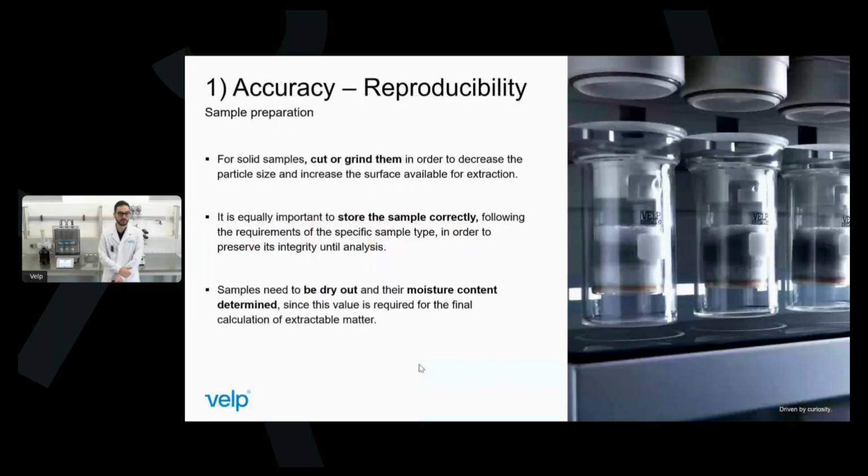Starting from some general things that we can face in both extractions, for solid samples the sample preparation is really important, because we have to cut and grind them before starting the extraction in order to decrease the particle size and increase the surface available for the extraction.